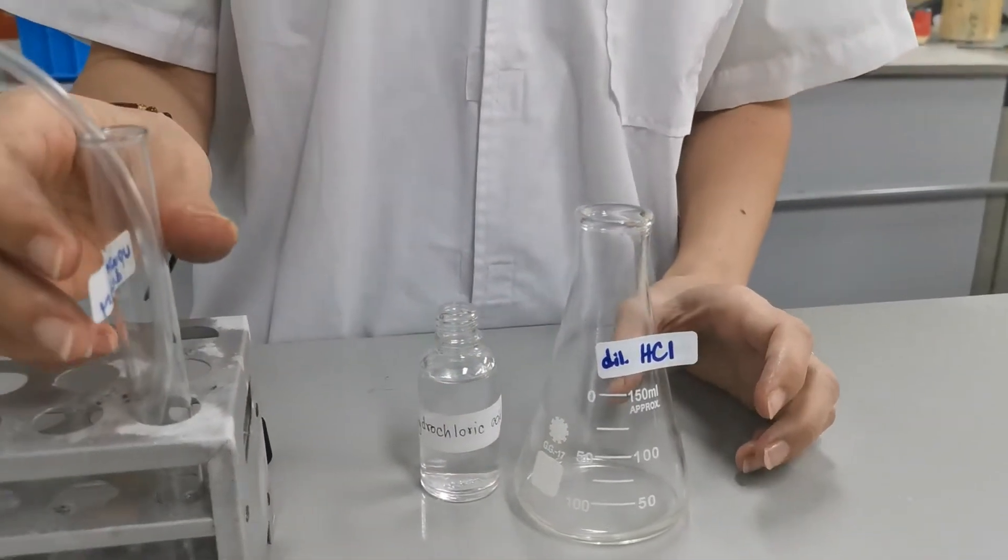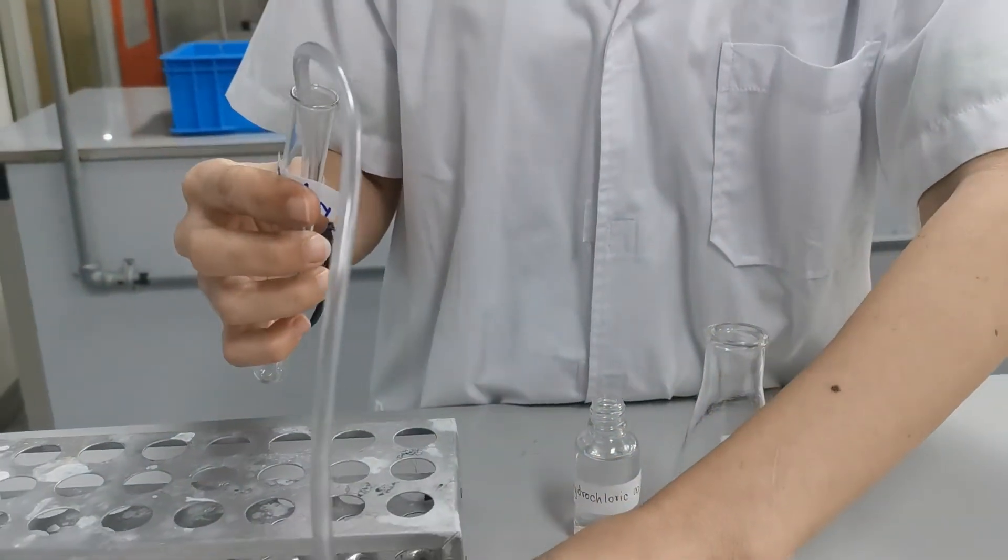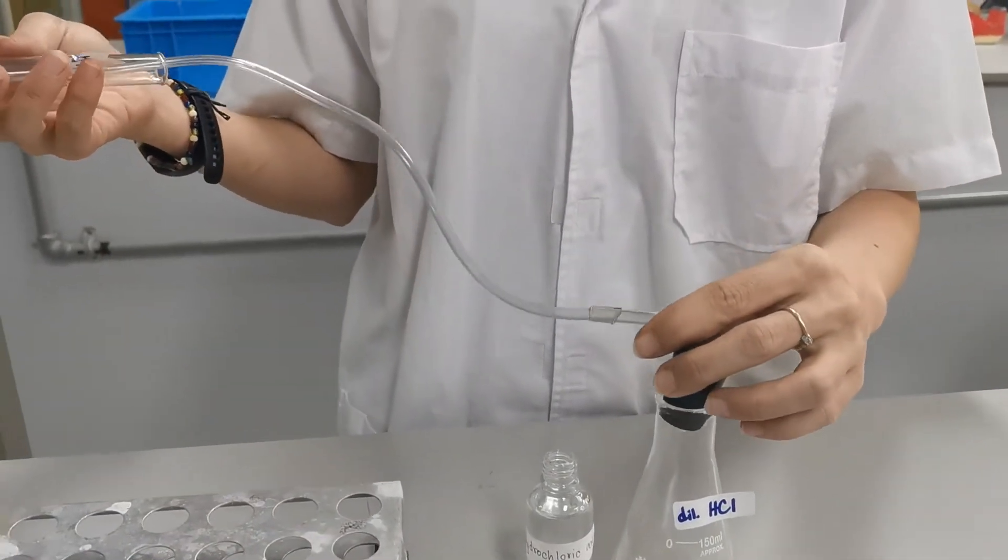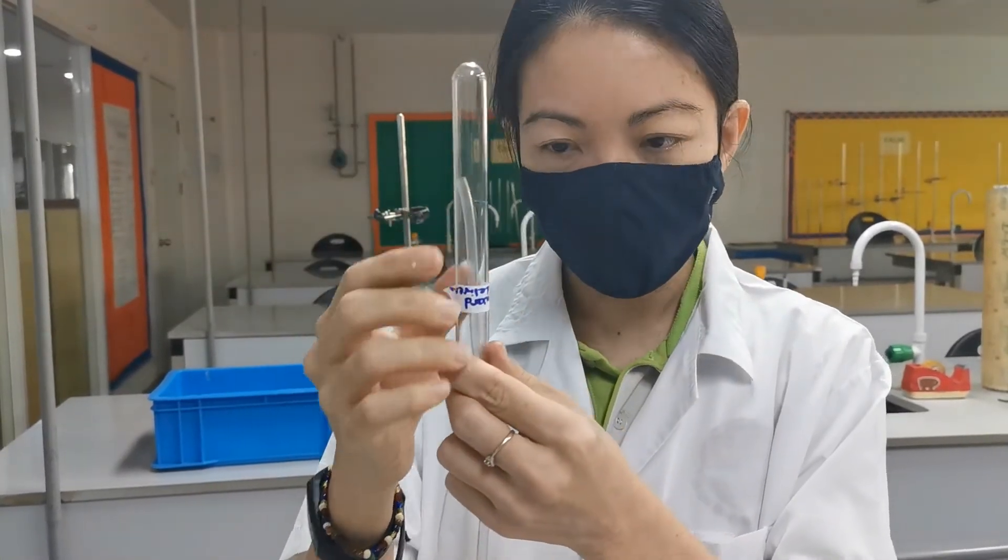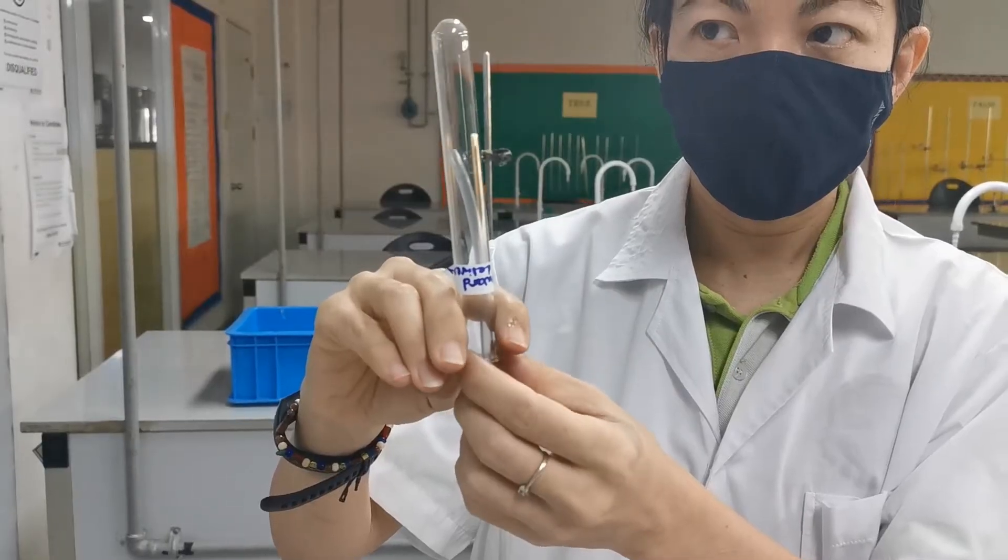If it's going to float in air, the best way to collect hydrogen gas is by upward delivery. This way the hydrogen will go up and collect in this test tube.